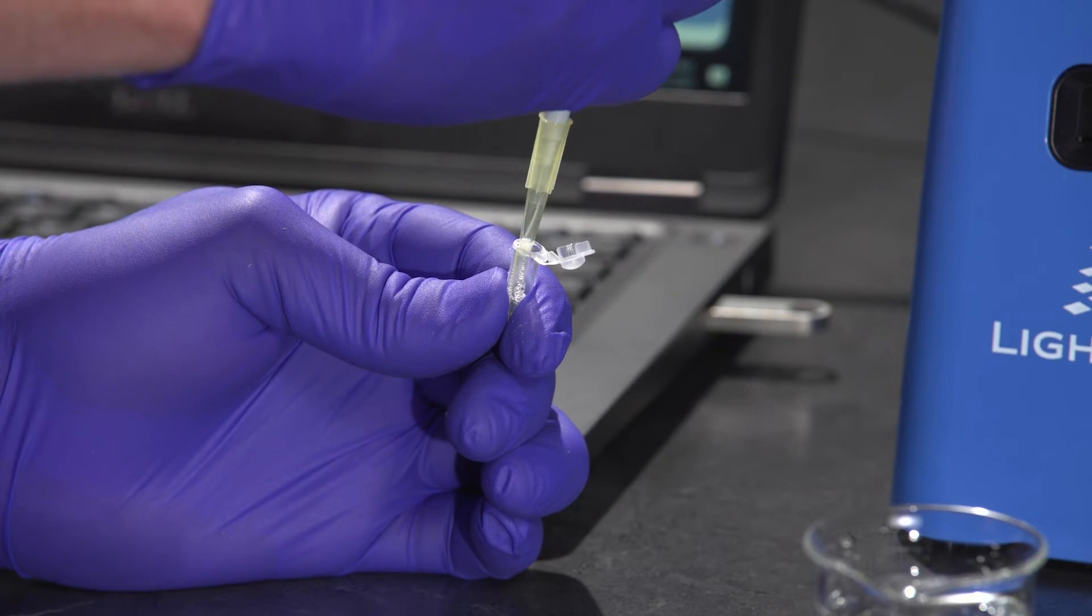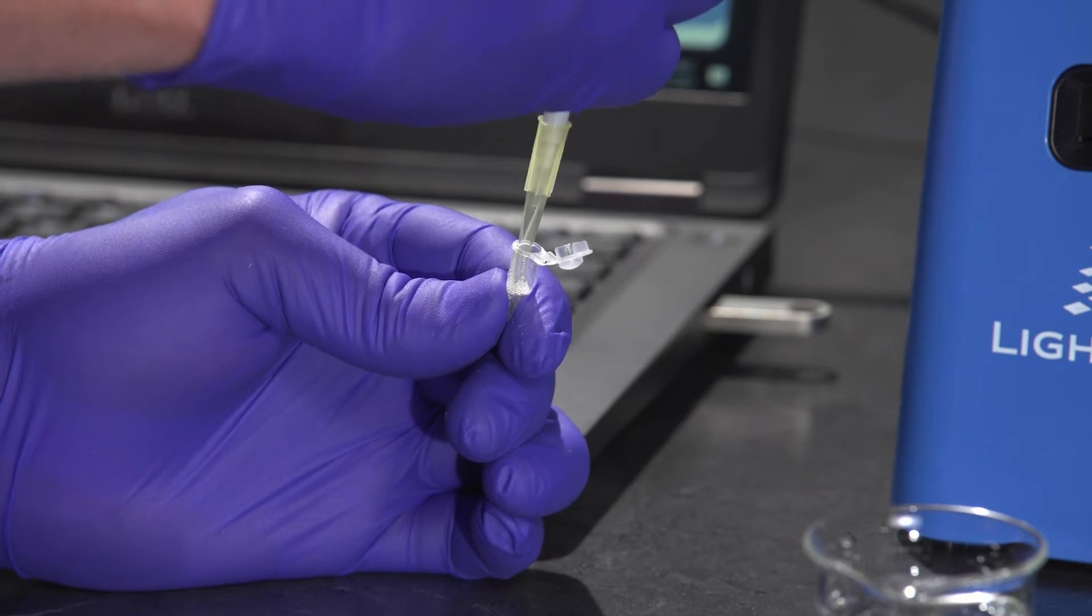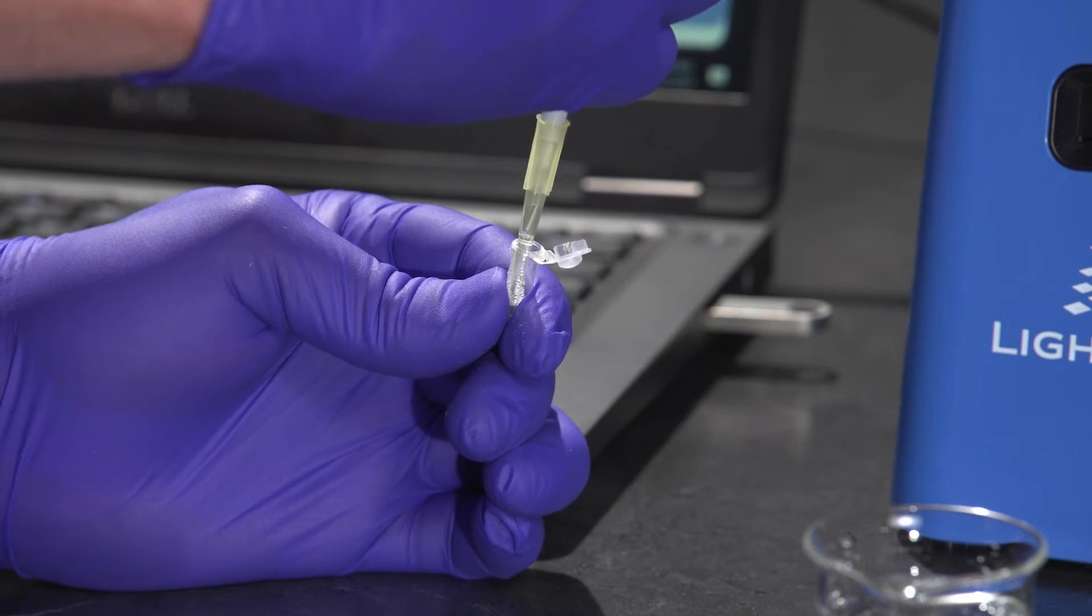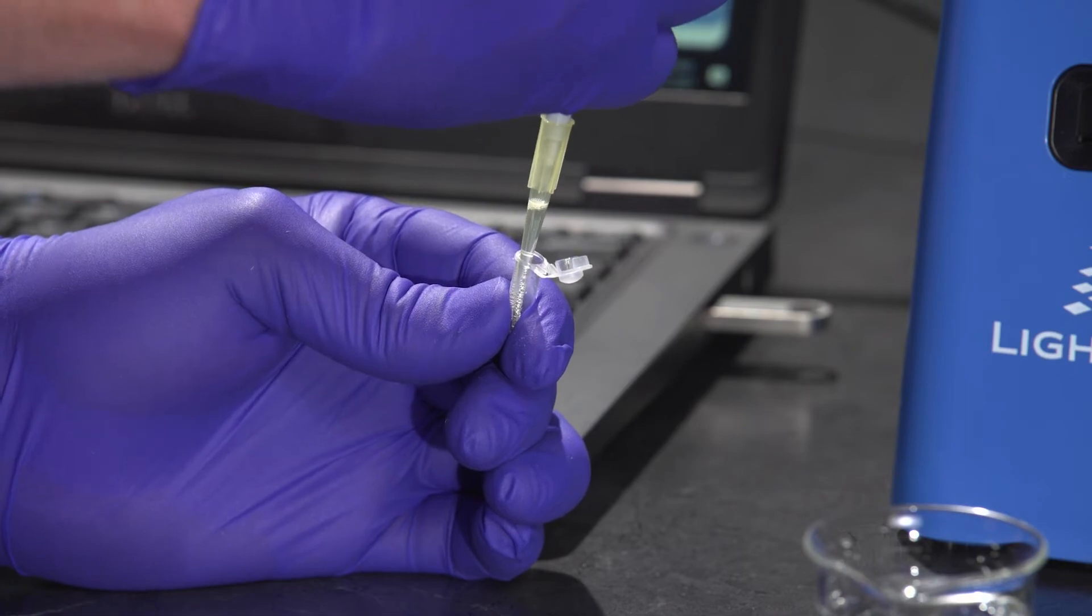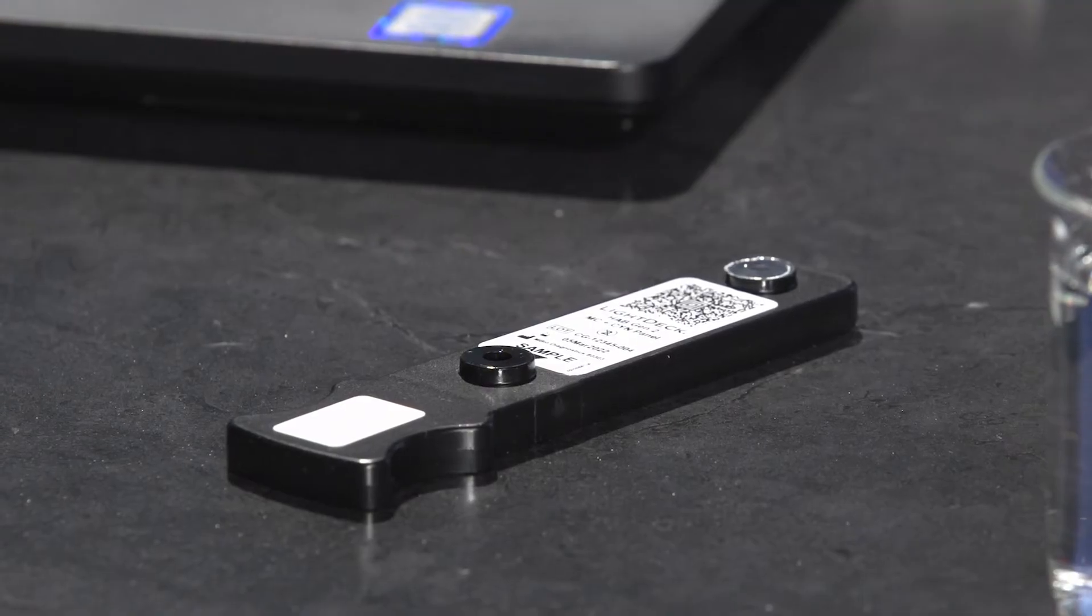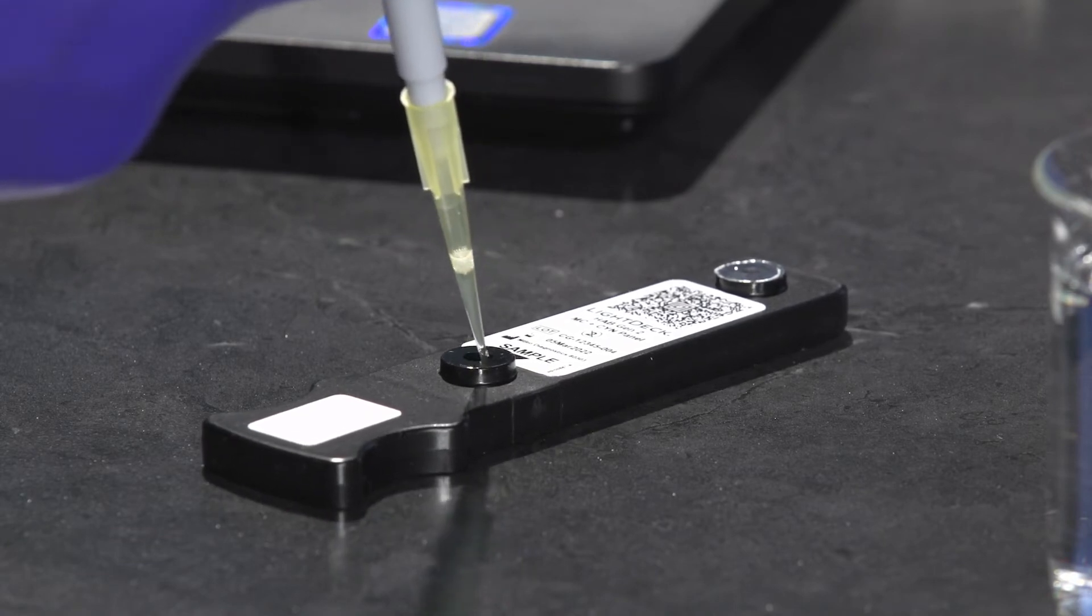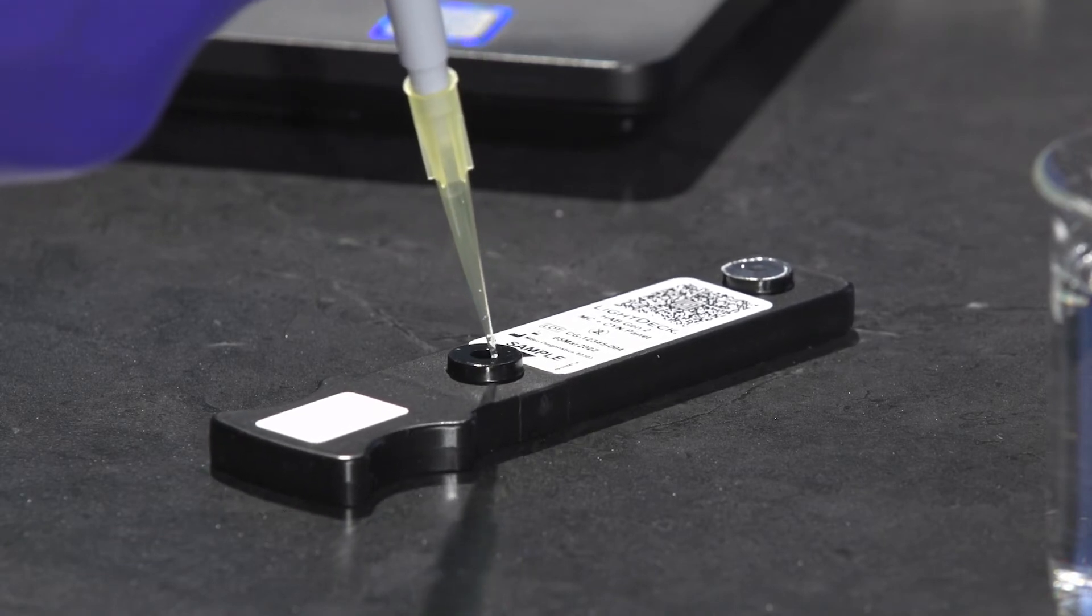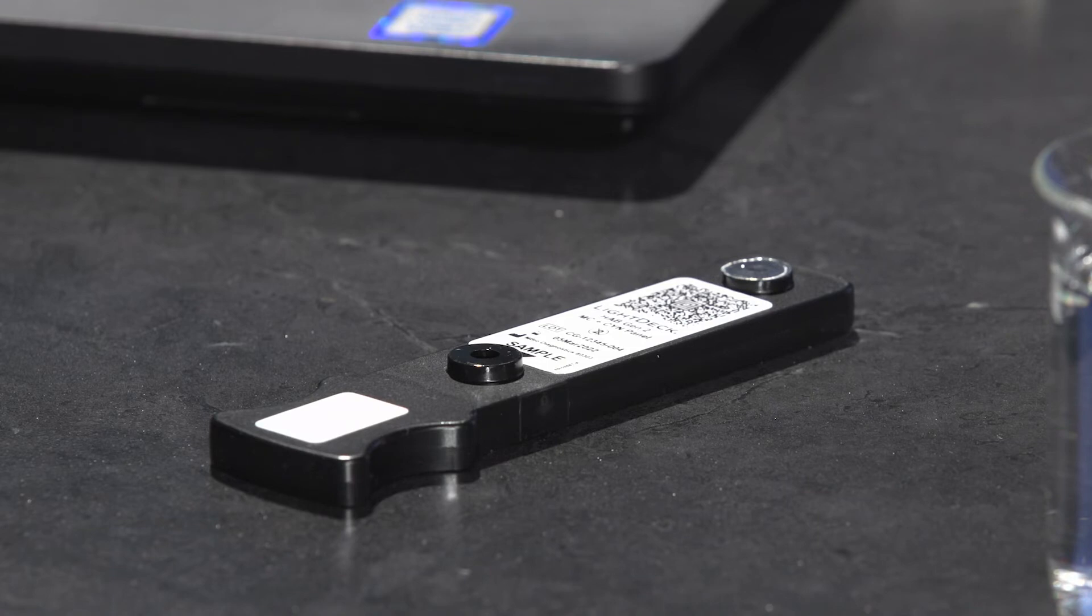Then once the sample has been mixed 10 times within the reagent tube, we're going to transfer the sample to the sample port on the test cartridge. And the sample is now ready for analysis with the analyzer.